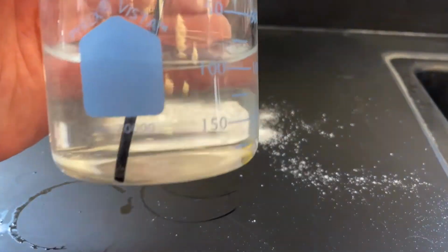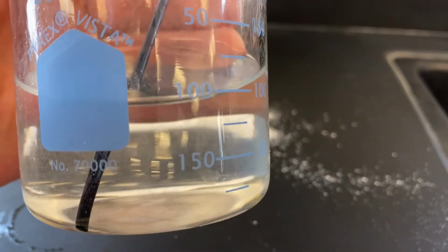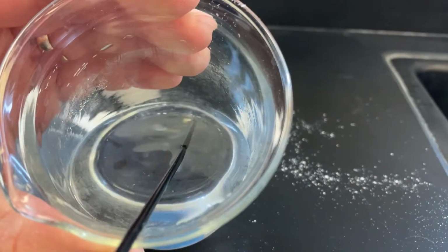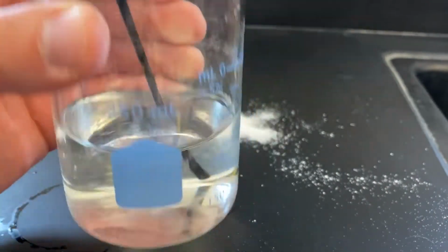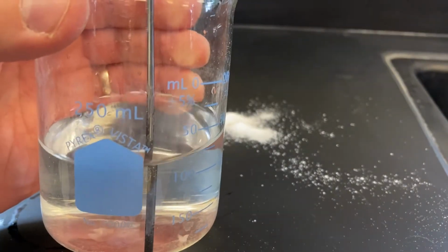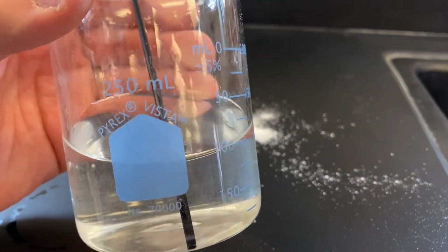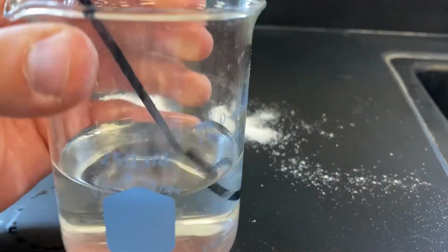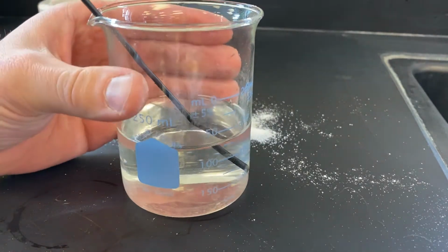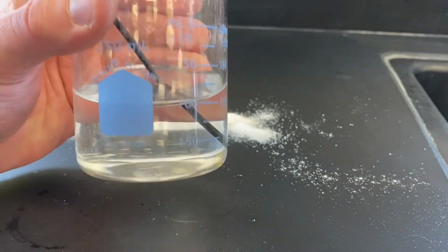Take a close-up look at this. I don't see any sugar in there. So if we're taking observations on this part, I see no pieces of sugar floating around there. In fact, the water doesn't even look cloudy. It looks perfectly clear. So size, I can't really say I can determine a size just by looking at it, nor can I determine a shape. The shape of the water is just whatever shape the container, the beaker, is. Color, I can't see the sugar, but I do see some water, so I'll just say the water's transparent.